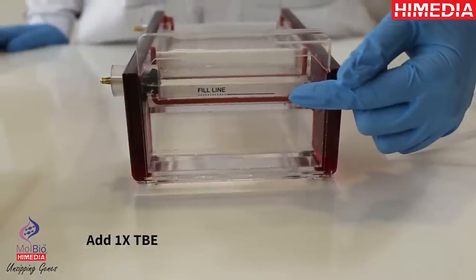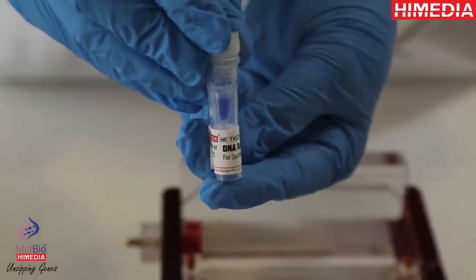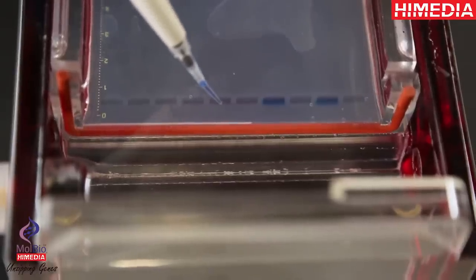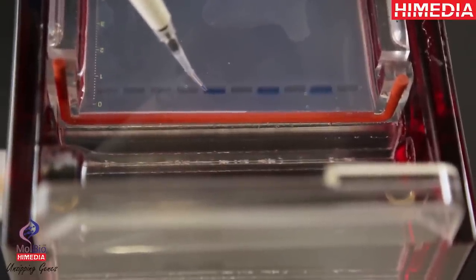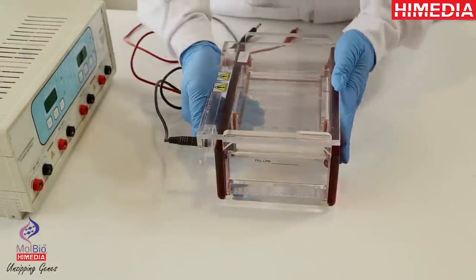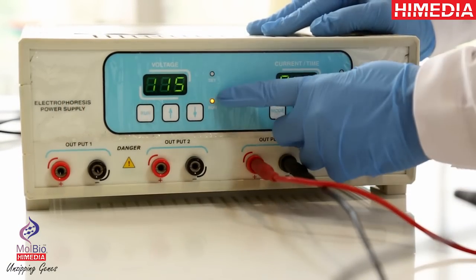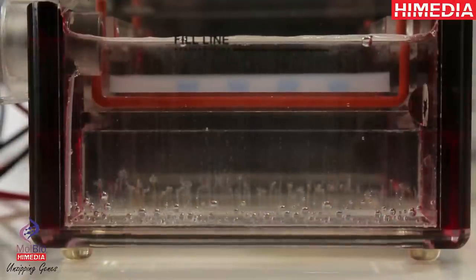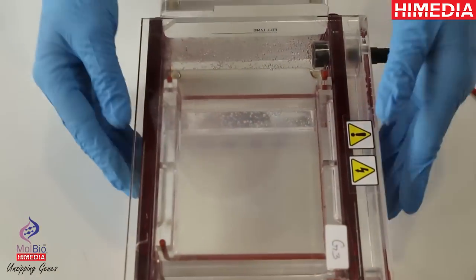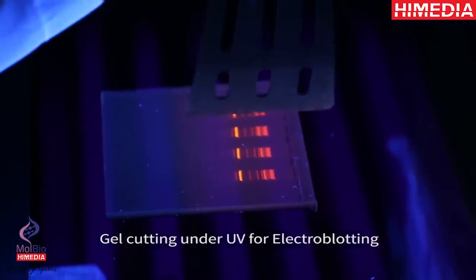Add 1X TBE. DNA sample. Gel cutting under UV for electroblotting.